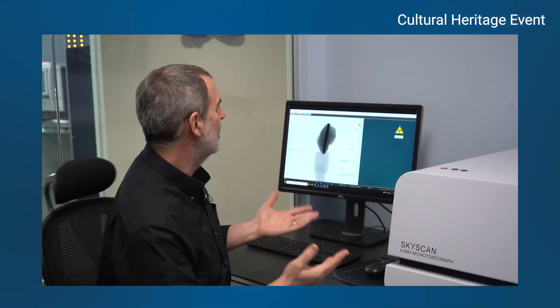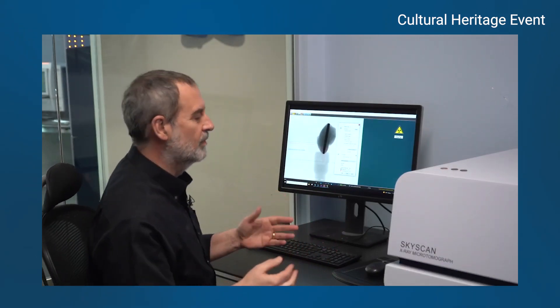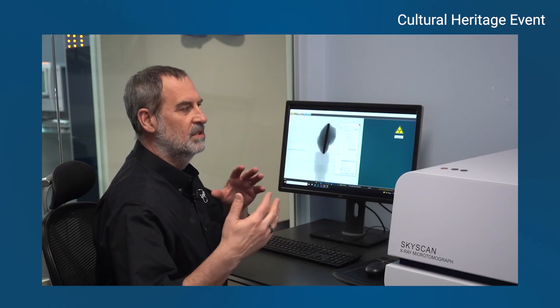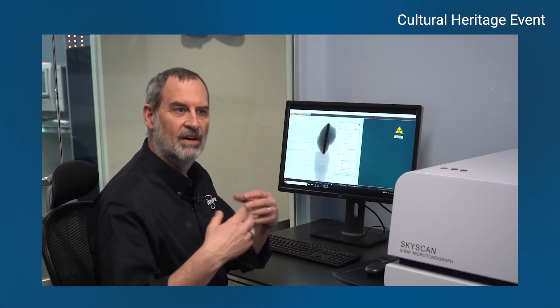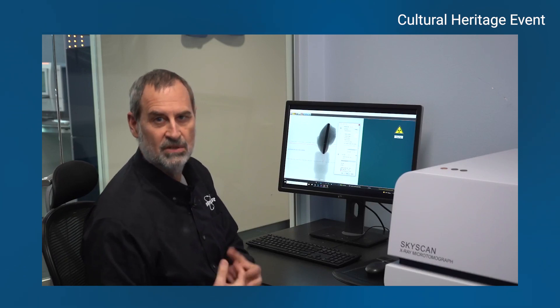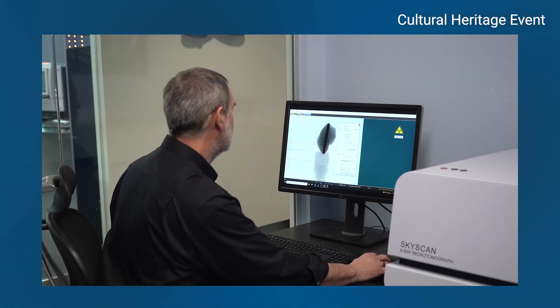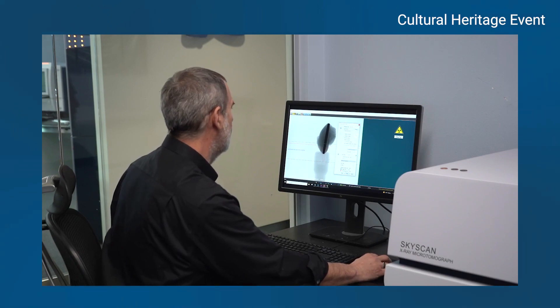I've actually done all that with these samples already. We have four pennies today: a fresh one, two with various levels of damage, and a fourth one which is completely encrusted and hidden in dirt and grime. Let me pull up sample number one.